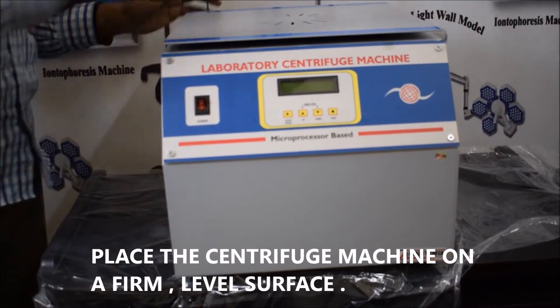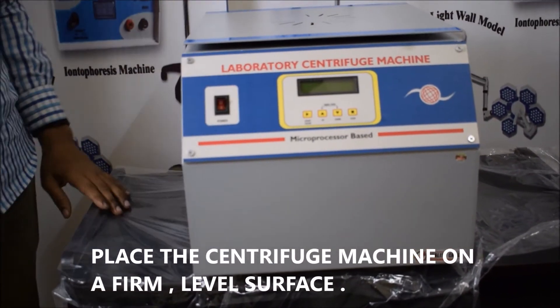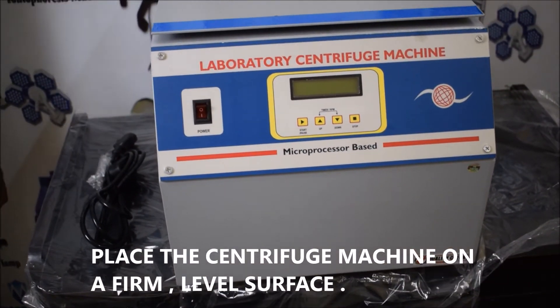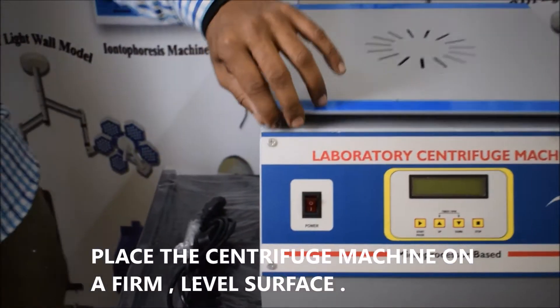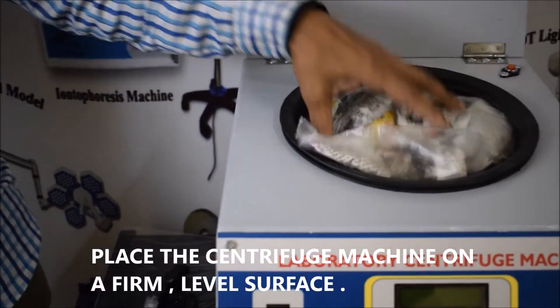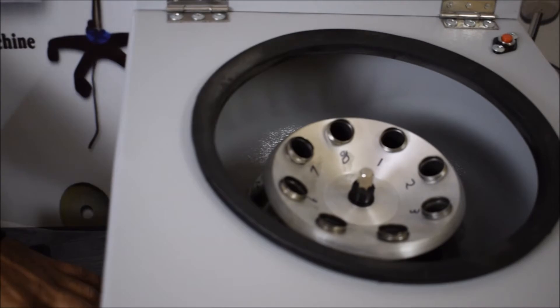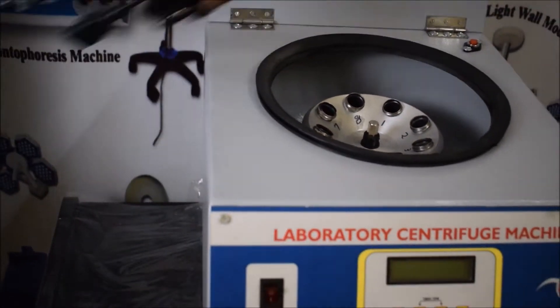While placing the centrifuge machine, always keep in mind that you should keep the machine on a firm or level surface. Because of the high speed at which the centrifuge spins, it needs to be housed on a solid flat surface. Try to find a level table or counter that properly supports the weight of the centrifuge machine.